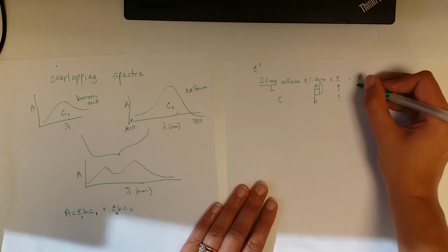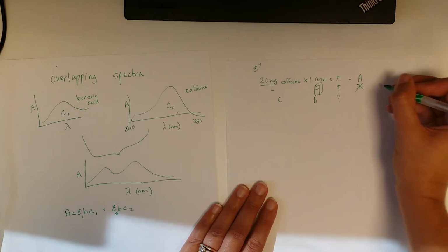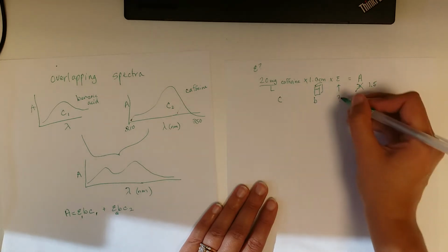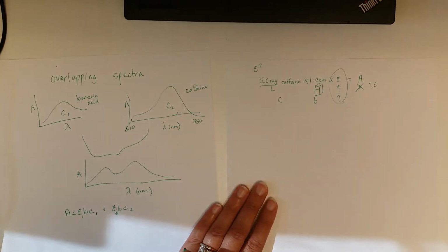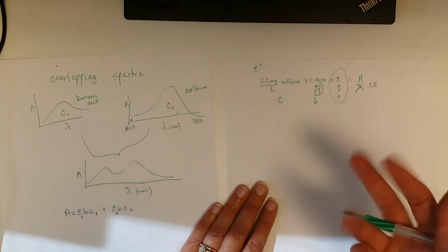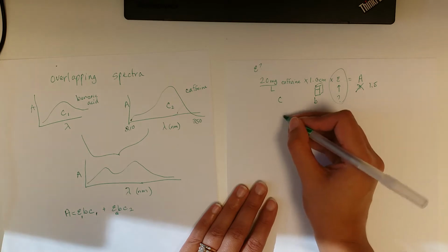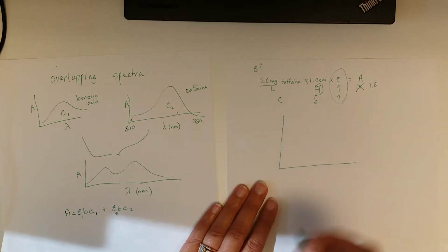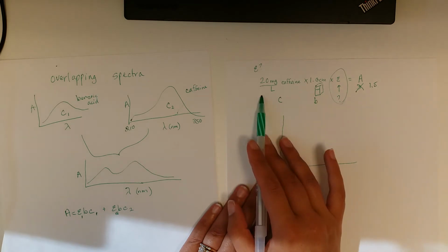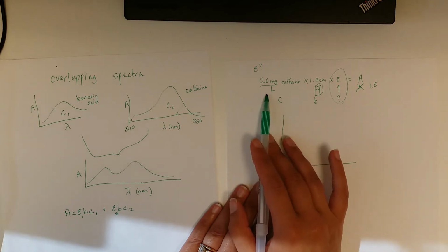And maybe you get a number. Maybe you get 3. No, 3 is bad, that's too high. Maybe you get 1.5. You can just rearrange and solve this for absorptivity. If you do that once, then you have a number. If you do it multiple times, it's much more accurate. So you guys have made concentrations ranging from 4 milligrams per liter all the way up to 20.